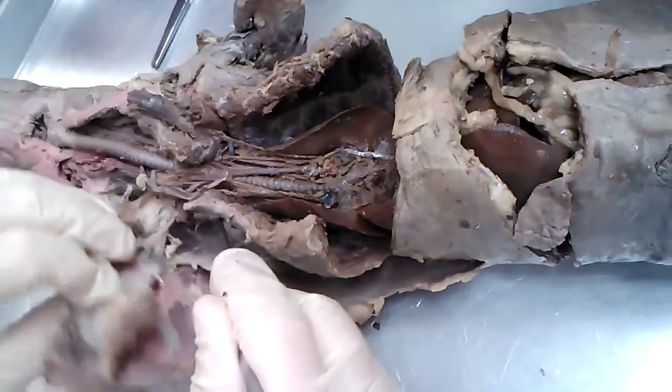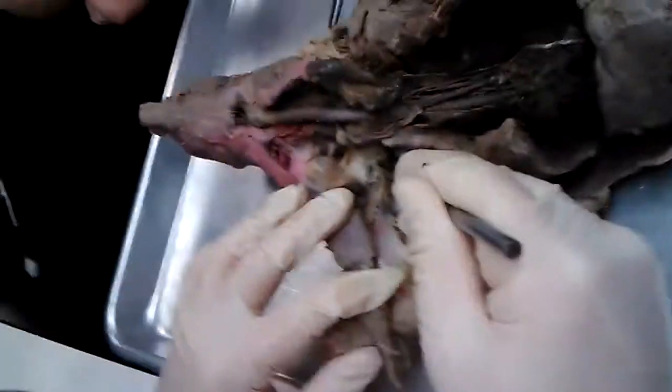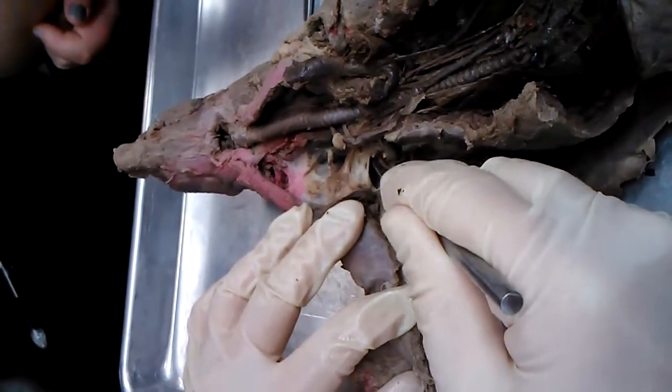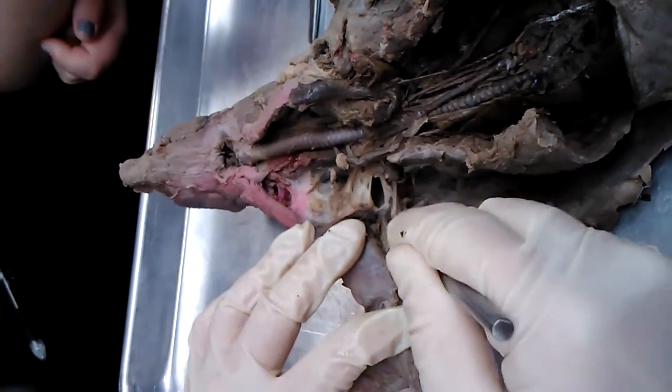subclavian. Out here in the mink's underarm, by the way, if you see an artery going out in this area, the artery and vein out in this region would be the axillary artery and the axillary vein. The nerves here, all these white strings, that's the mink's brachial plexus. So all the nerves we see in the mink's underarm out in that region.